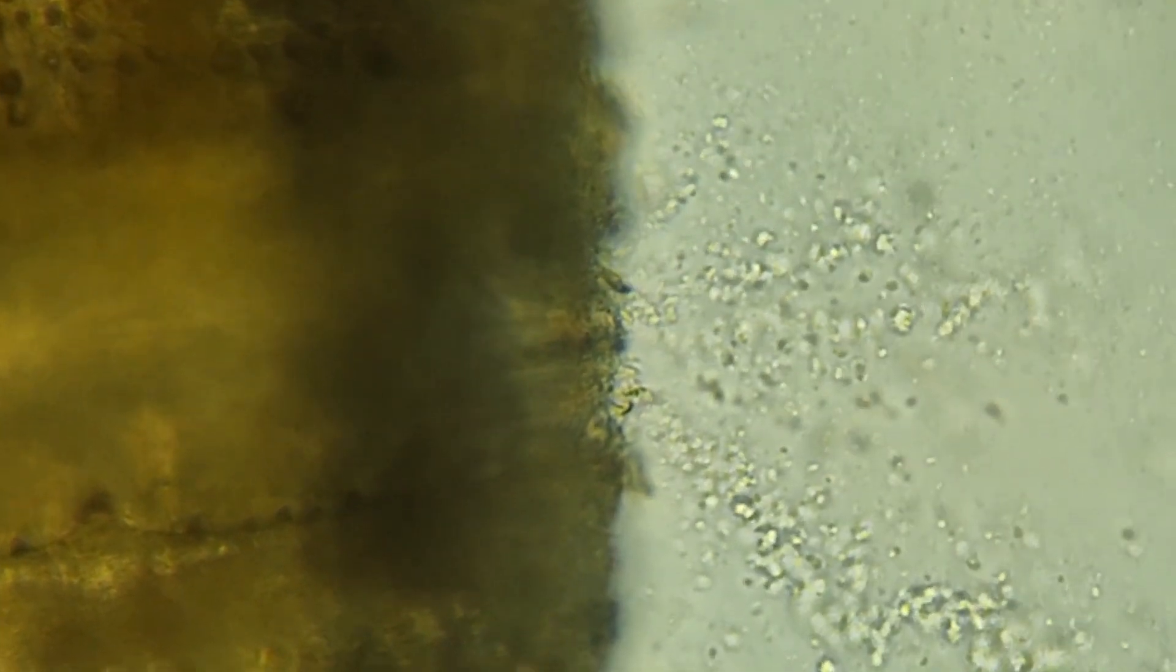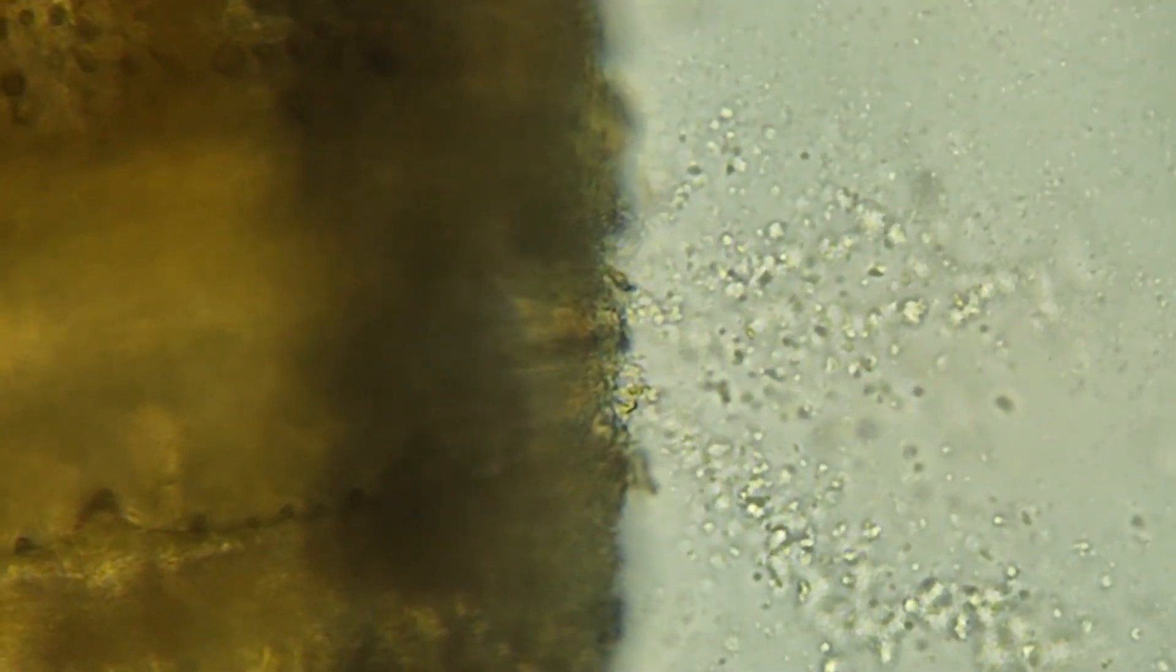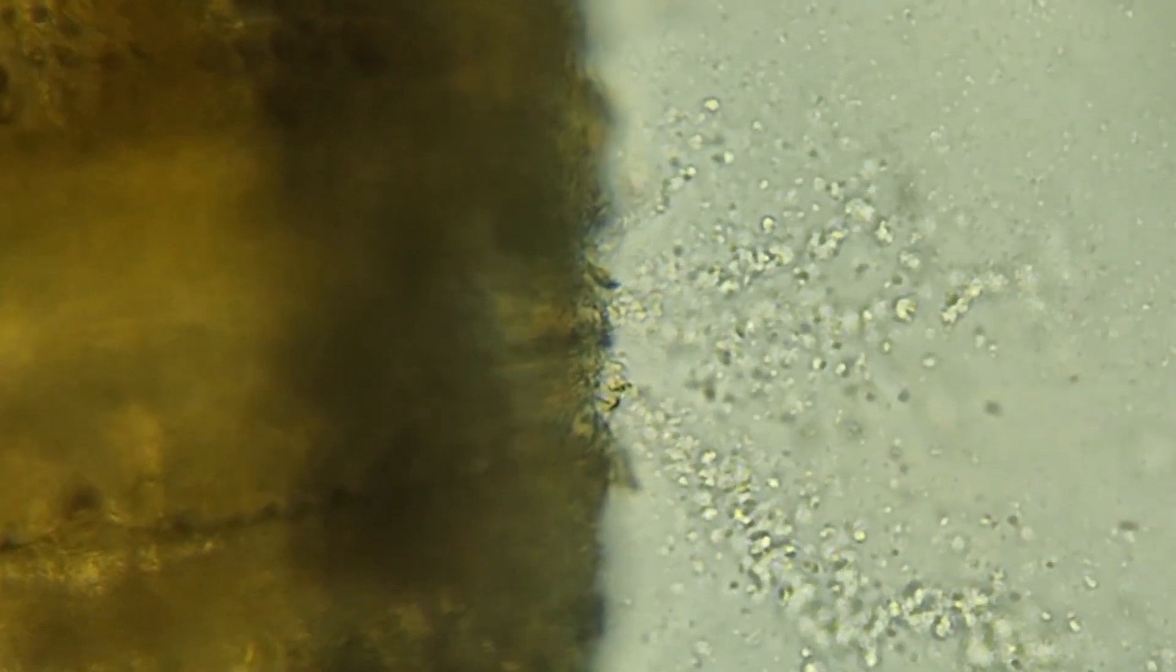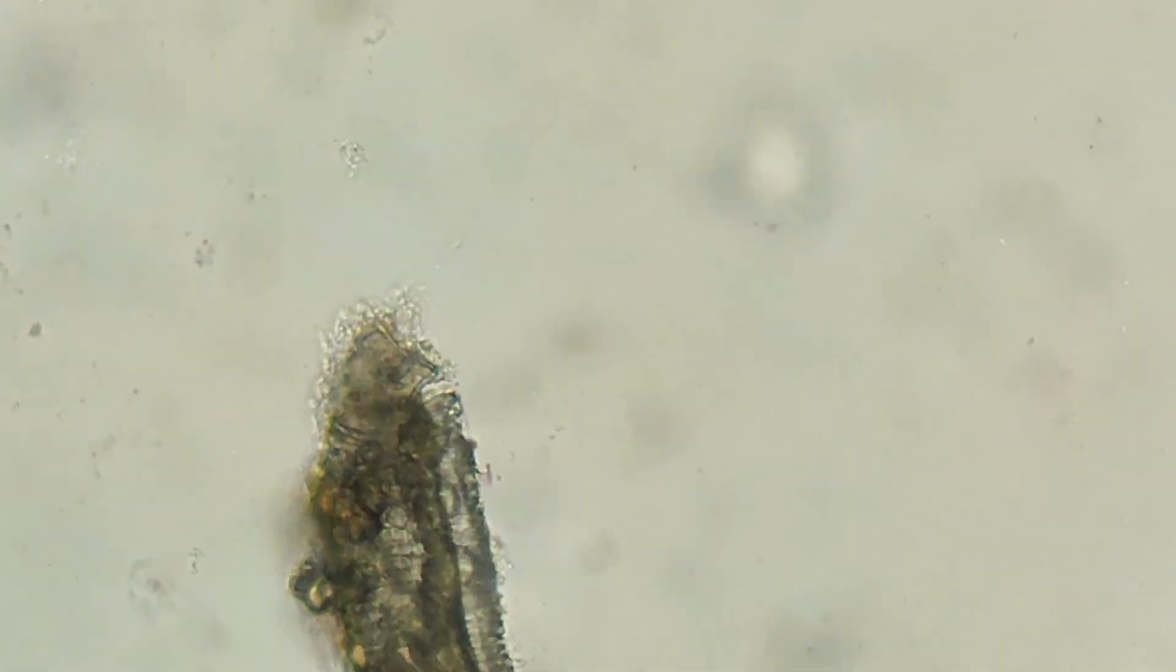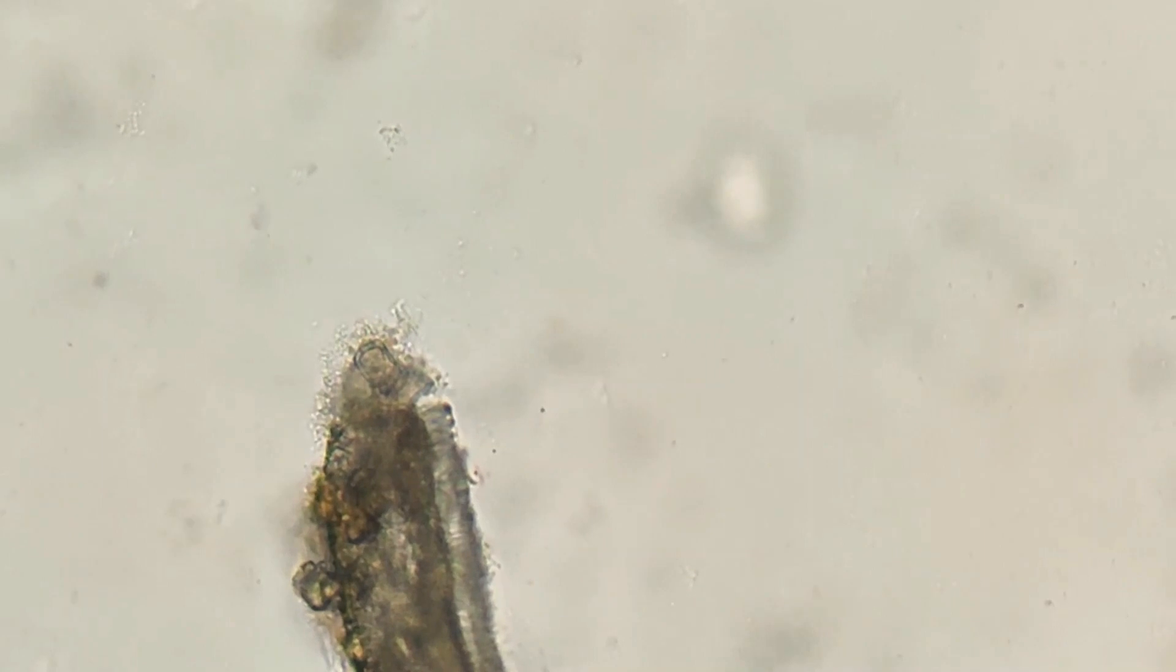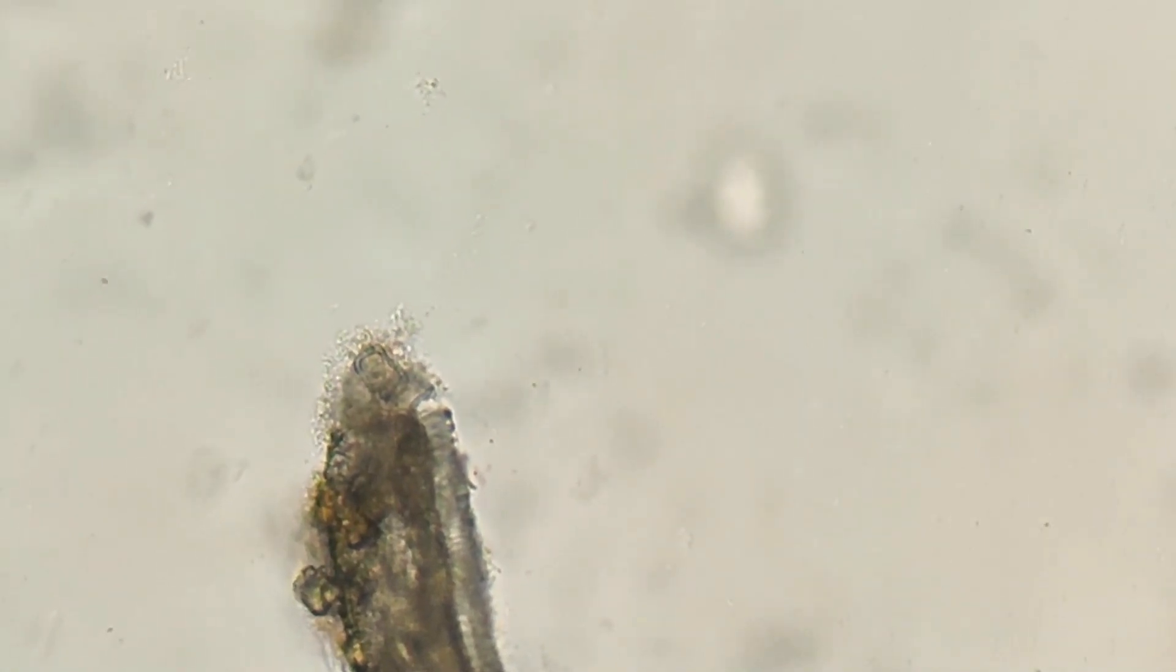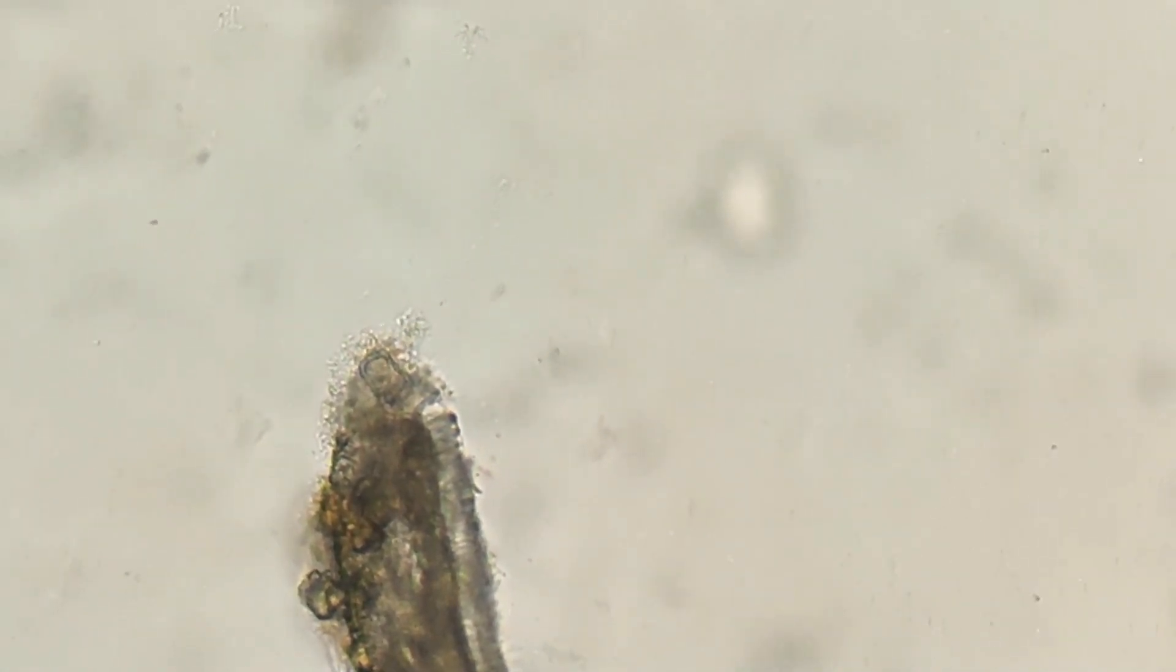The diagnostic feature to confirm the bacterial disease is the emanation of slimy ooze, exudate made of polysaccharide, and bacterial cells from the cut ends. This test suits well for diseases like bacterial wilt and blight. When we use infected plant sample, the streaming is seen prominently from the infected tissues.